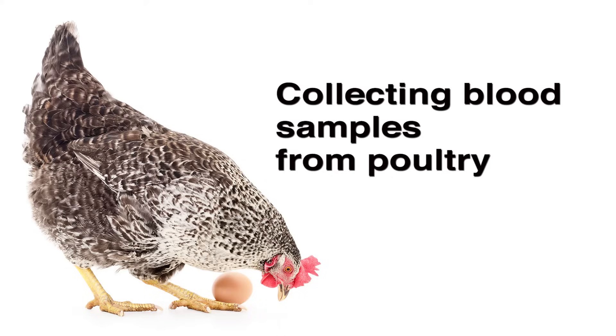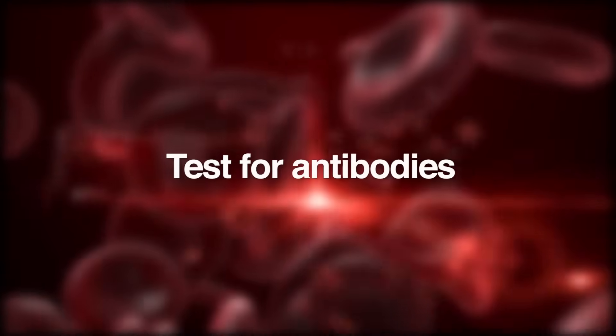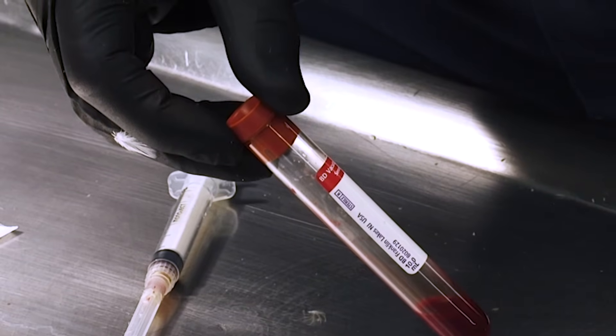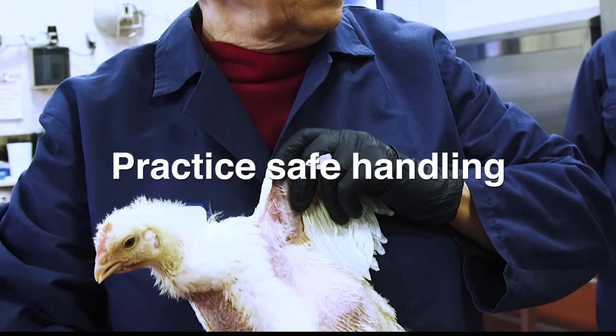Learning to collect blood samples from poultry is an important skill for veterinarians, poultry technicians, and poultry caretakers. The most common reasoning for collecting blood samples is to test for antibodies that birds produce as a result of exposure to certain infectious diseases. To obtain a good sample, it's important to know how to collect, handle, and store it. It's also important to practice safe methods of handling the bird to prevent unnecessary stress or possible injury to the animal.